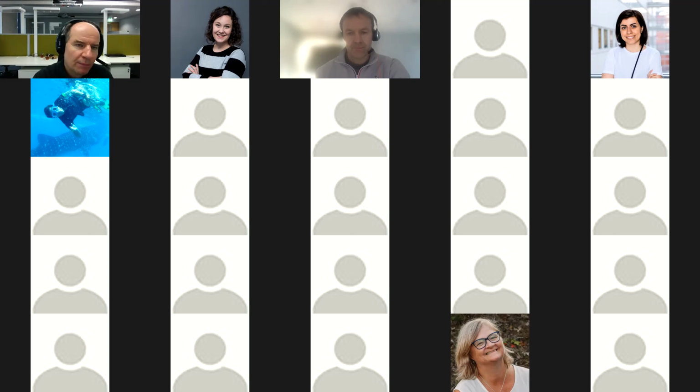For Omero running locally on your laptop, you will not enjoy the features very much, and you will have a constant struggle keeping up the Omero server as well as the Omero client on your laptop. Okay, so it's not very practical. If you have some proficiency in IT, if you are not scared, for example, of a command line, you might be thinking about that, but it's not what people are doing.